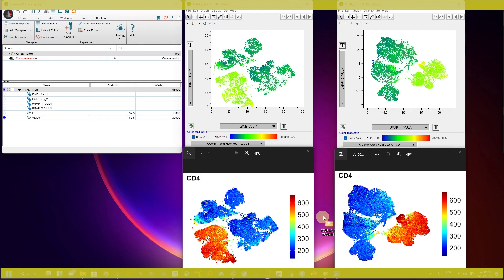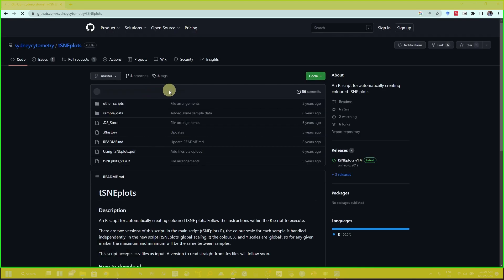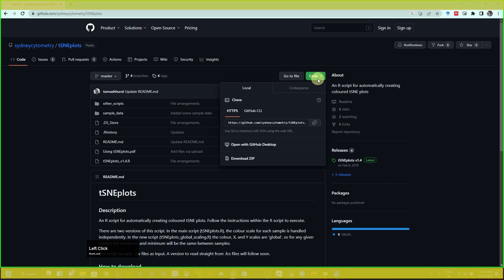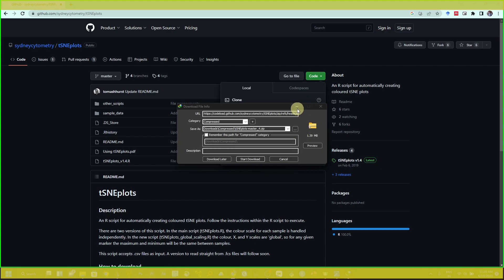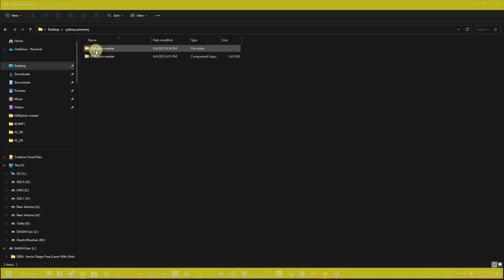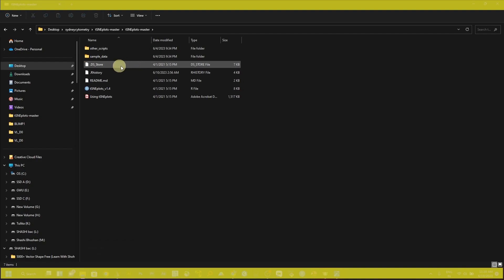To get started, type 'Sydney Cytometry slash t-SNE plot' in Google and search. You will get a link from GitHub — just open it, click on the code, and download the ZIP file. I have already downloaded it, so I'm going to show you. Here is the downloaded file and I have already extracted it.